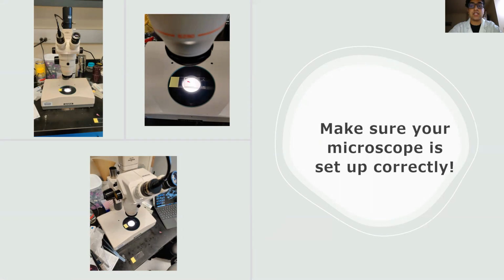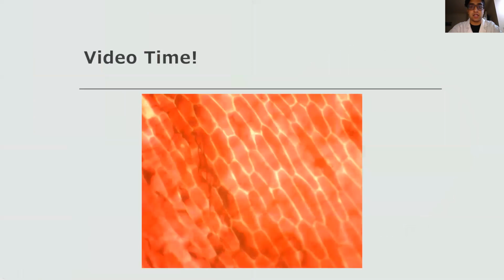And now we have a short video for you guys to watch. We're not going to be watching the entire thing in slow motion. As I said, this process does take a while. So we're going to go through it while talking about what's going on in our solution.